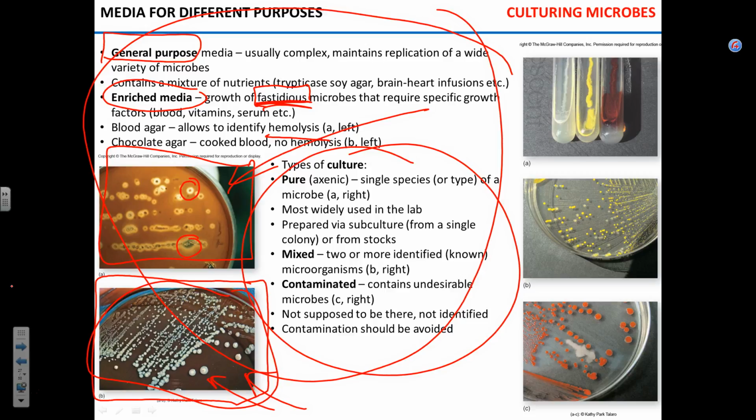Those two microbes that you can see on the screen: if you put Staphylococcus epidermidis on the blood agar, it will grow, but red blood cells will remain intact. If you take Streptococcus pyogenes, the causative agent of strep throat, and put it on the blood agar, blood will be gone in 2 days. It is a hemolytic microbe. It destroys the red blood cells. That's why it's infectious and can cause a lot of complications. Is that clear? Did I answer your question? Good.